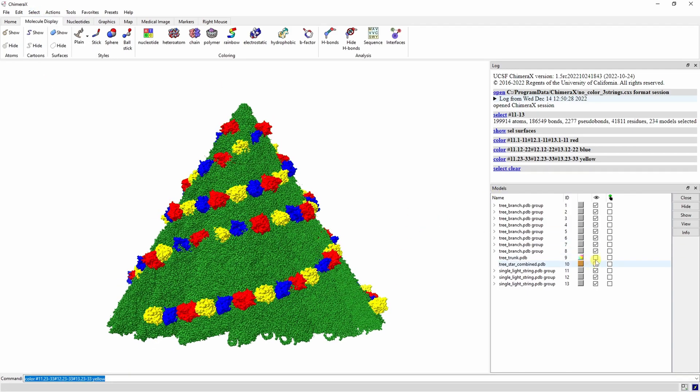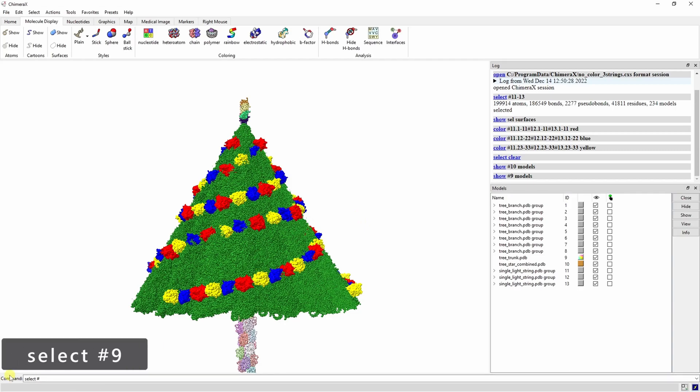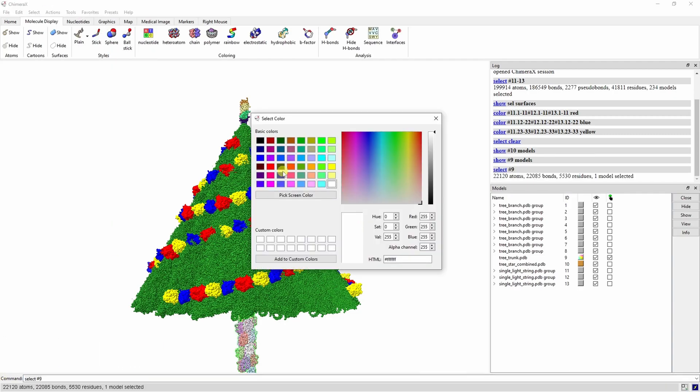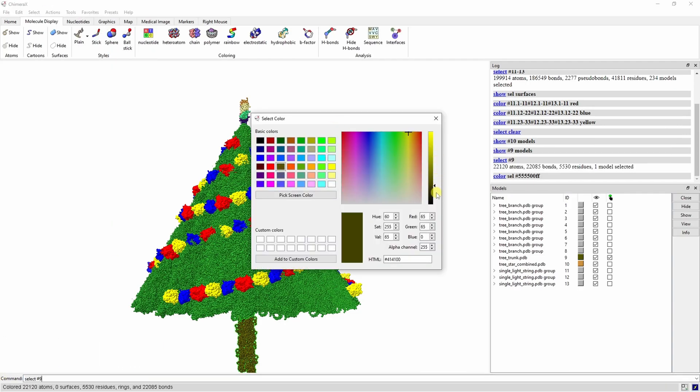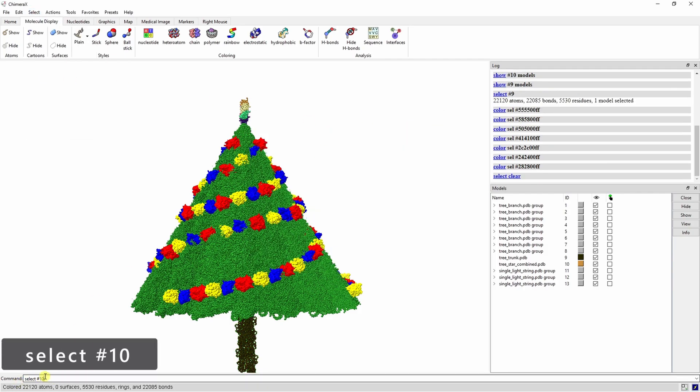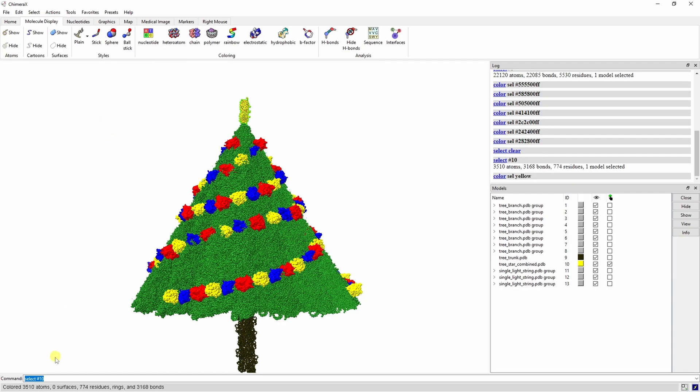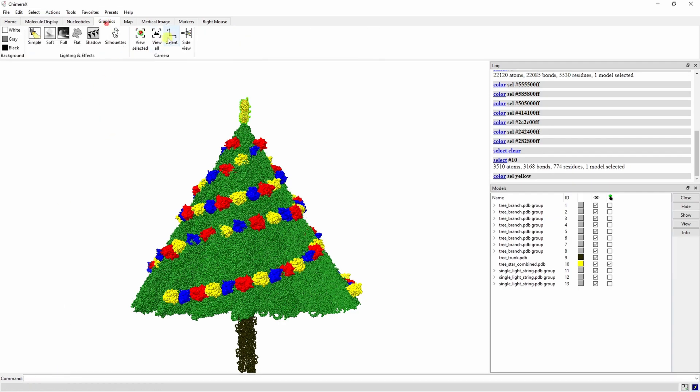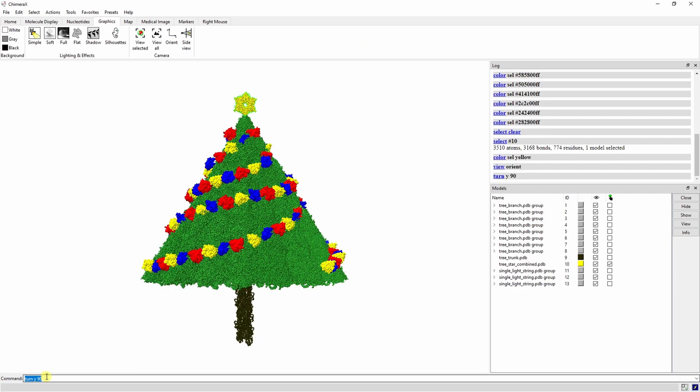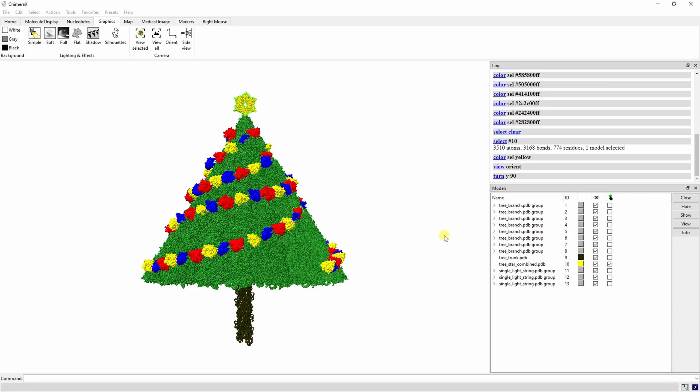Show the star and the tree trunk again so we can color them. Save this session file and then we can go on to making a quick movie.